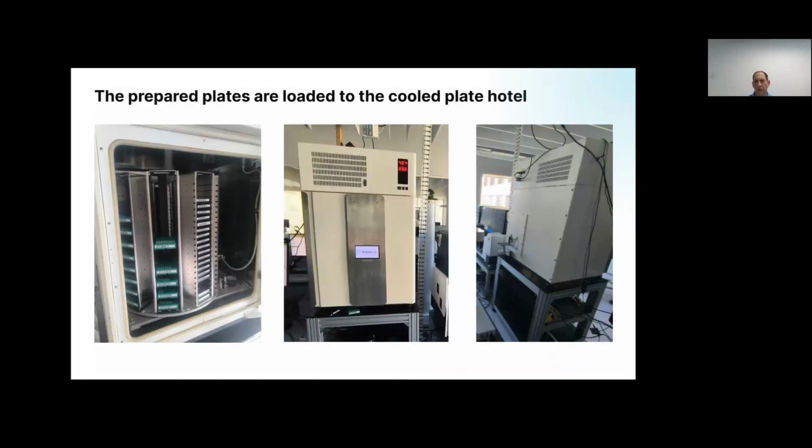And then we physically load the plate into the back of an automated fridge. You can see on the left, there are some probe plates and some sample plates. And then the other side of the automated fridge has a place where the plates will come out. And because this place is fixed, we can easily teach our robotic arm to pick up plates from there.